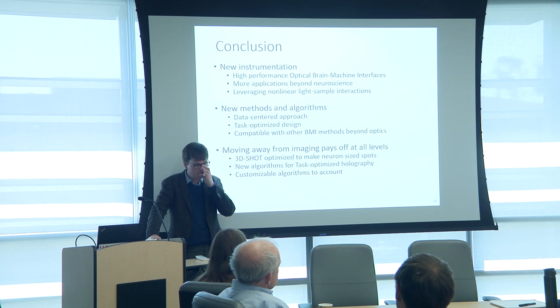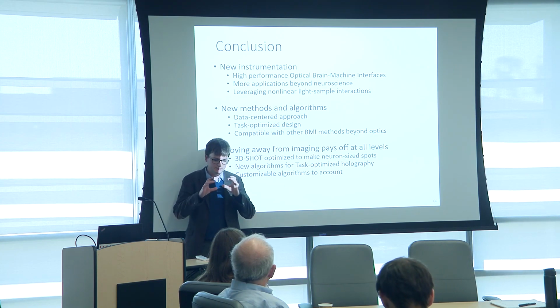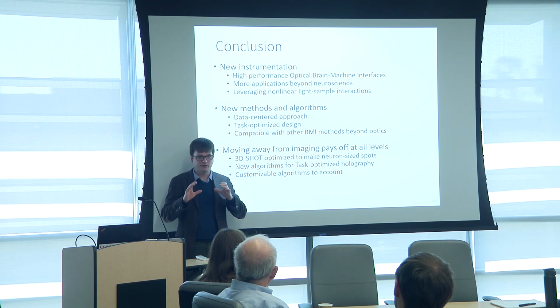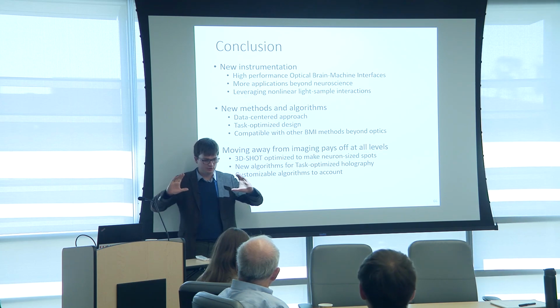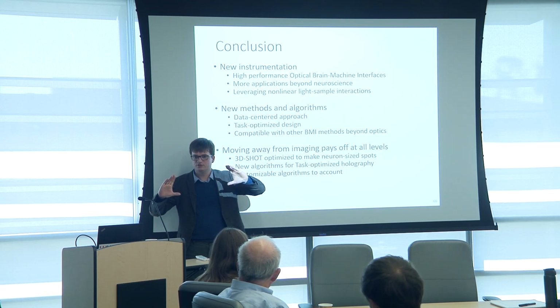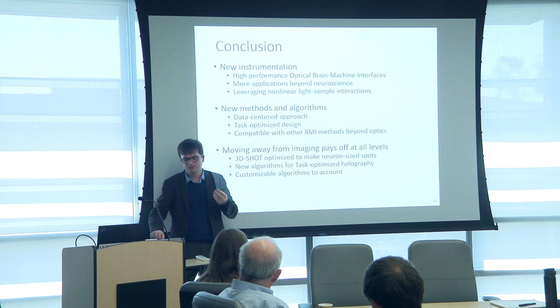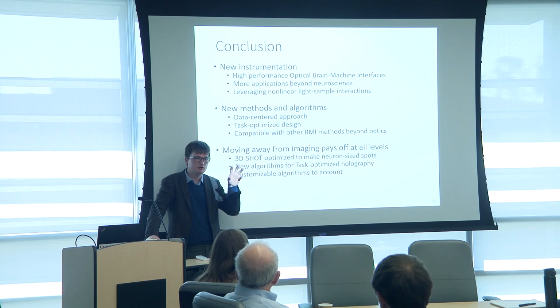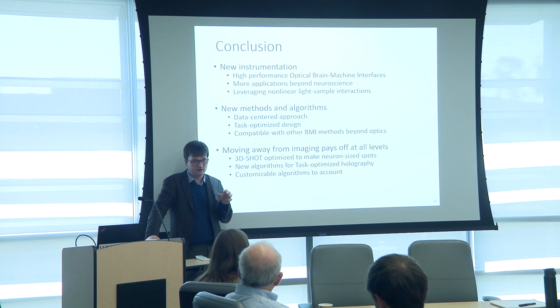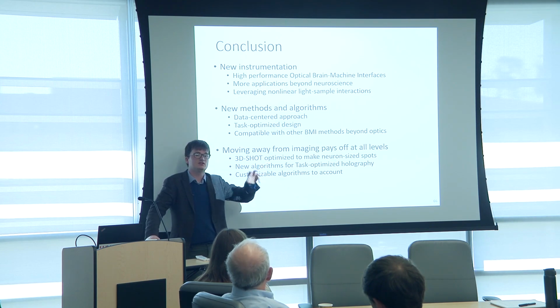And then in terms of technology, there are multiple things that are being done. One of them is stability. The same pixel is typically driven by a lookup table of voltage to phase. As we go towards better SLMs, when you're on a wide printed array of liquid crystal on the SLM, the thickness may vary, the manufacturing process may vary, and the lookup table in theory should be different for every pixel. The most advanced SLMs have lookup tables by clusters that allow you to rectify for some of the manufacturing defects when you're on the edge versus the center of the SLM, or to rectify for some of the holographic defects where the type of light you send to the edge is different than the type you send to the center.